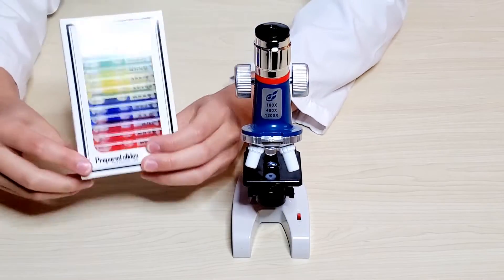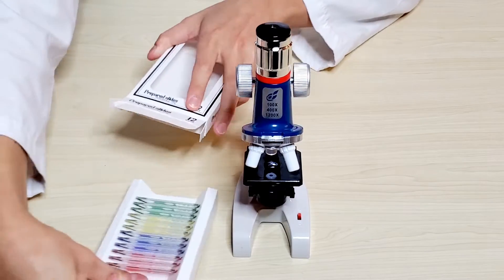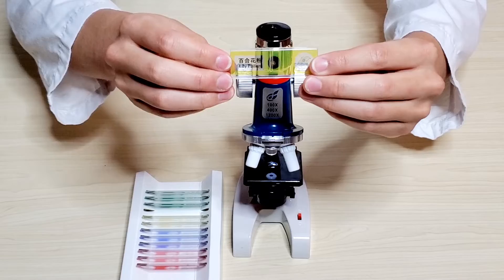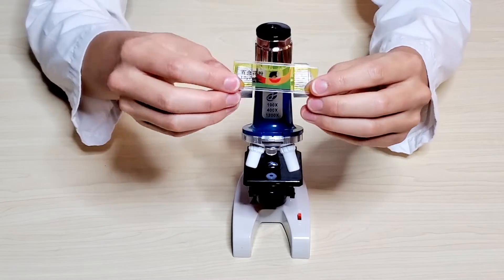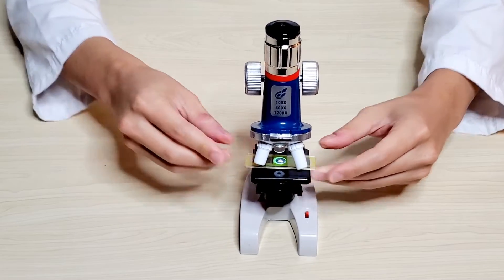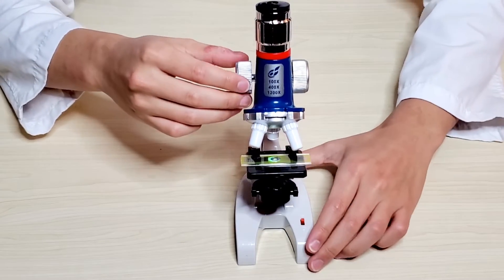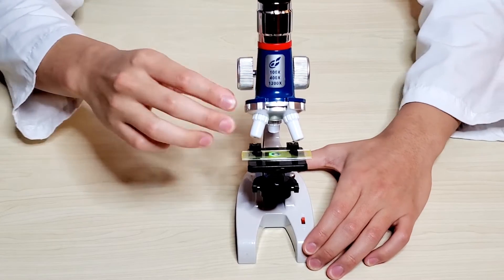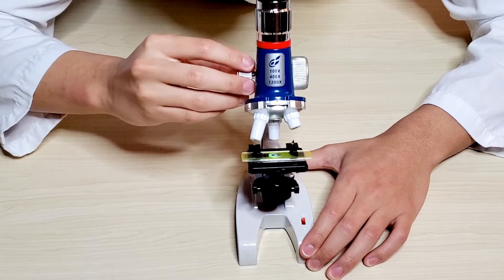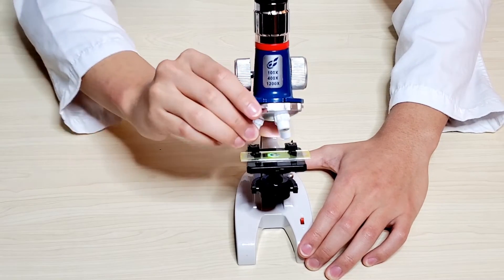We'll bring in the prepared slides and choose one — we'll be doing the lily pollen. After we've chosen our prepared slide, we'll put it onto the clips and onto the stage, right into the center of the light. Making sure the prepared glass is in the center of the light, we'll look through the low power. To see more clearly, we'll move on to medium power. To see even bigger and clearer, we can move on to maximum power.